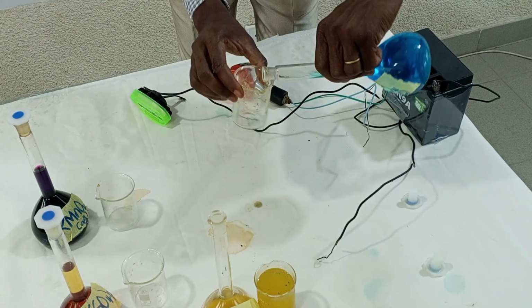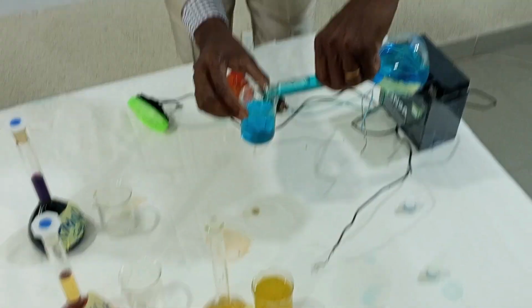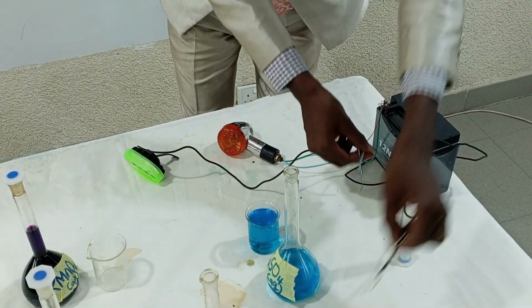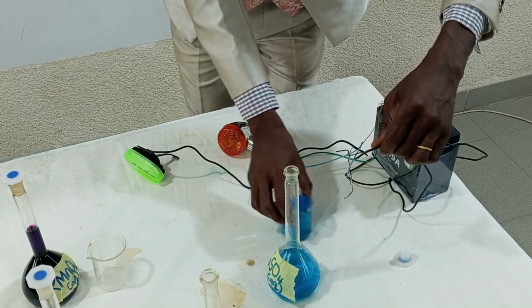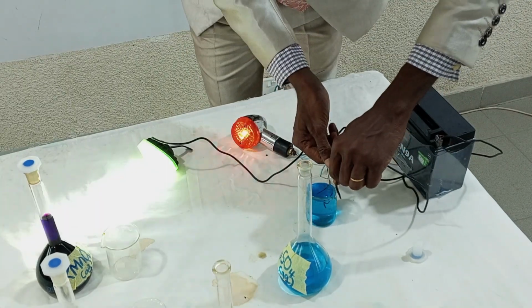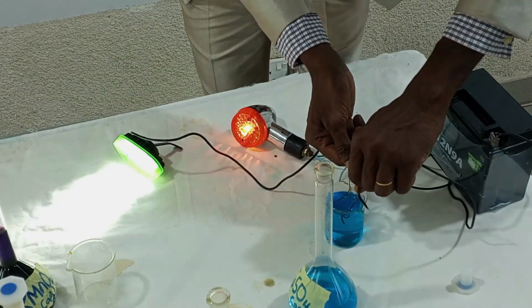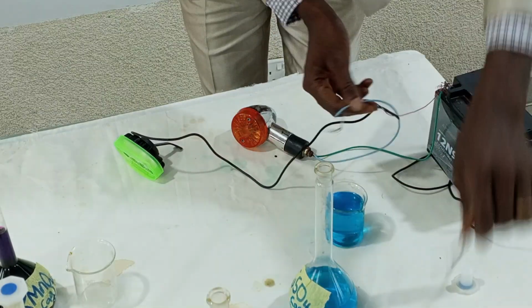This copper 2 sulfate contains Cu2+ ions and SO4 2- anions. Since they also contain ions, they can also conduct electricity. You see, copper 2 plus ion and SO4 2 minus. Since this salt also contains ions, good.